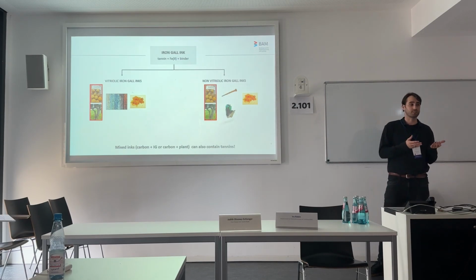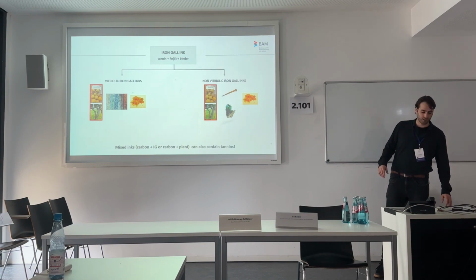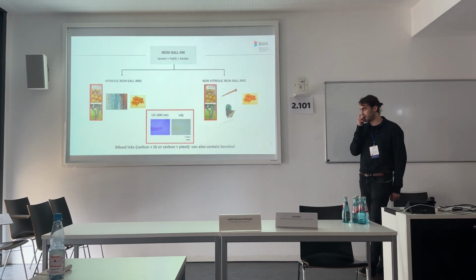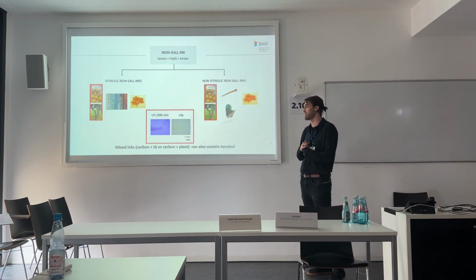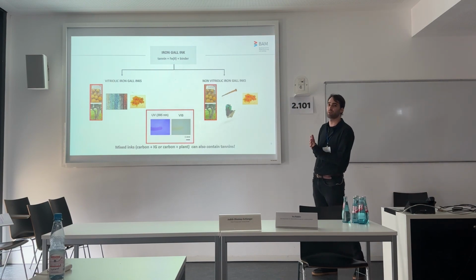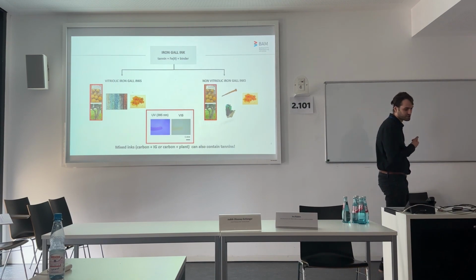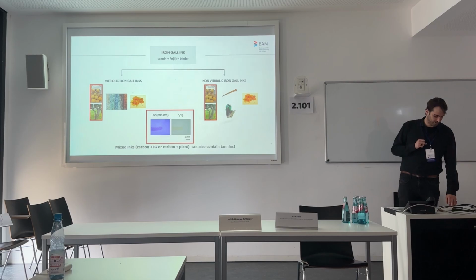How can we identify the presence of such? Especially in the case of mixed inks, where we have carbon, which masks the evaluation, and using photography in different wavelengths to see the type of ink. When we look at the plant ink, this is an example of a plant ink from a mock-up that I prepared. We see that the tannins present in such an ink are quenching the fluorescence, blocking the fluorescence of the substrate. So this gives us a hint about the presence of such. However, it doesn't give us an answer what kind of tannins, or are they really present there.